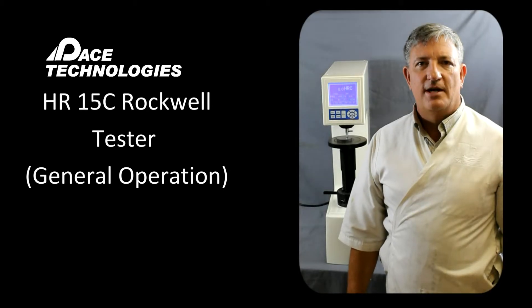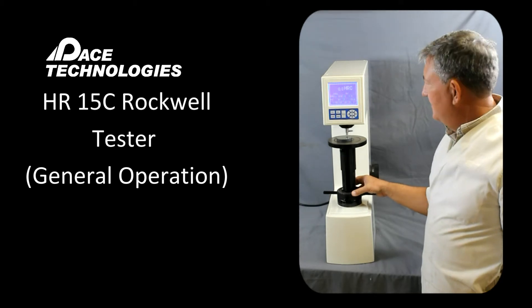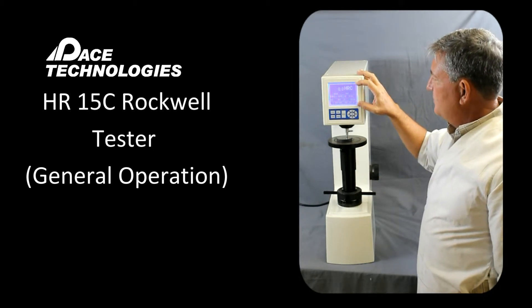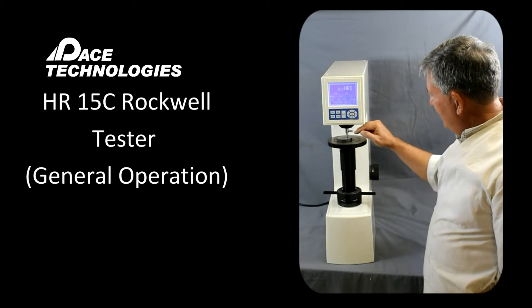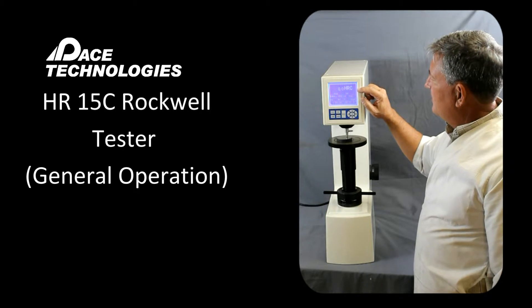The HR15C Rockwell Hardness Tester. This particular hardness tester is very easy to use. We have our LCD screen here that shows our parameters as well as our results. We have our load adjustment knob over here. Right now it's set for 150 kilograms, and we have a diamond indenter, so this is going to give us a Rockwell C scale.